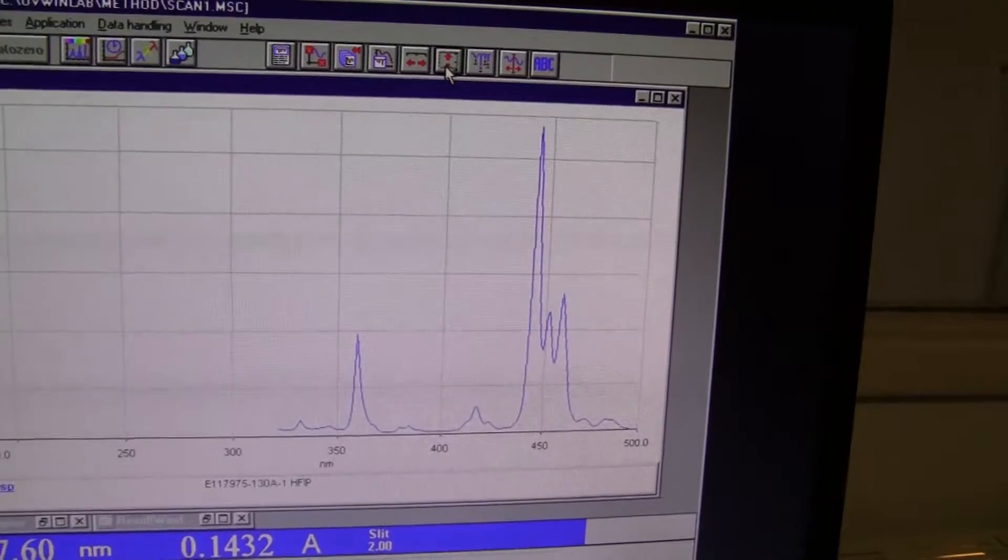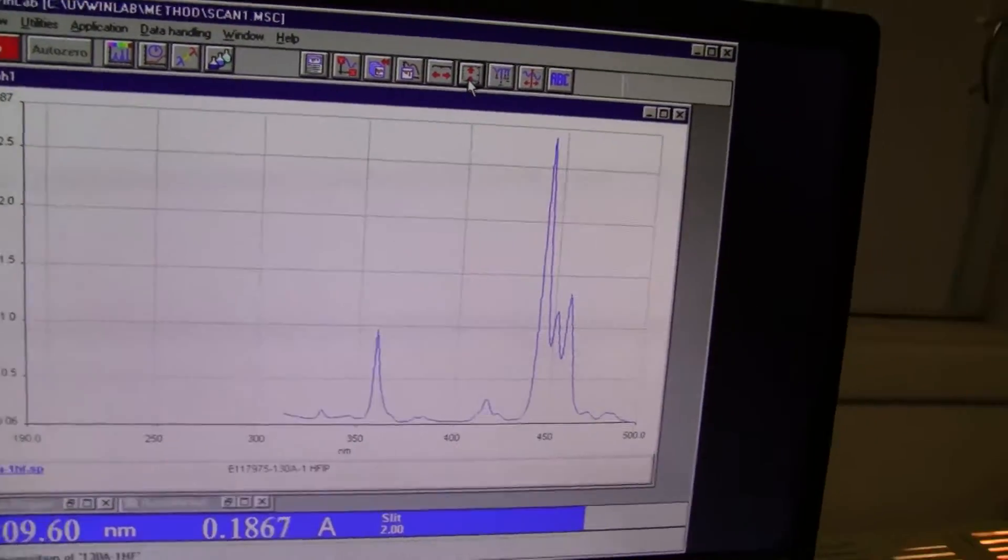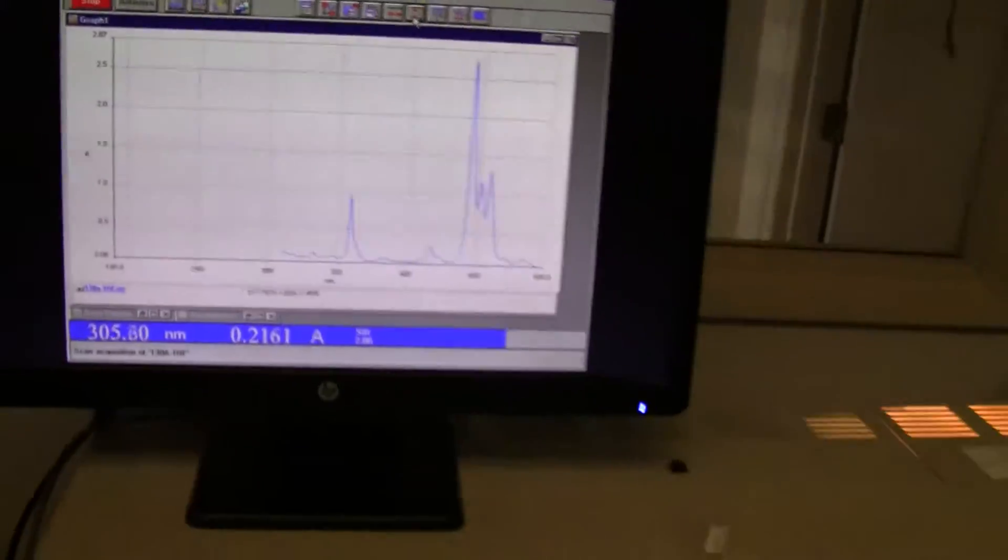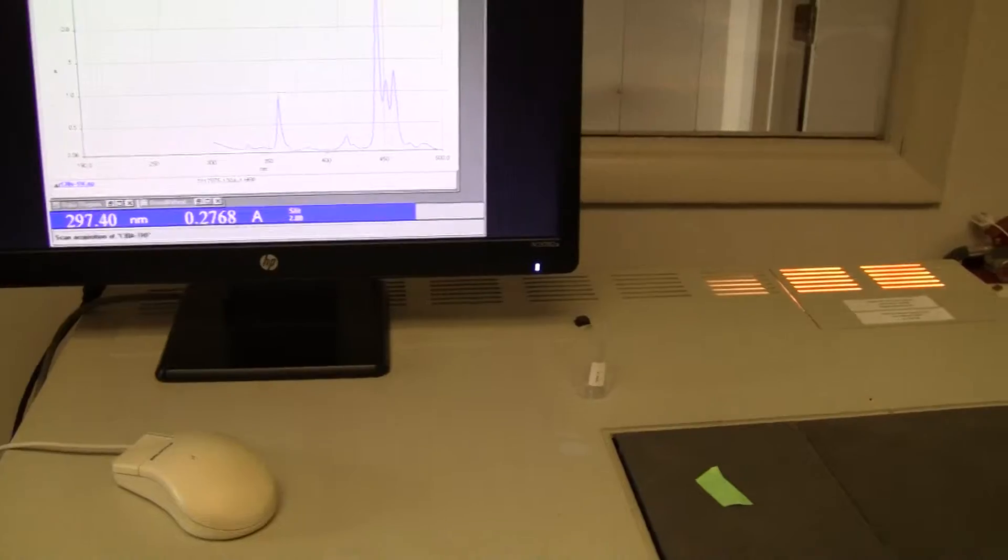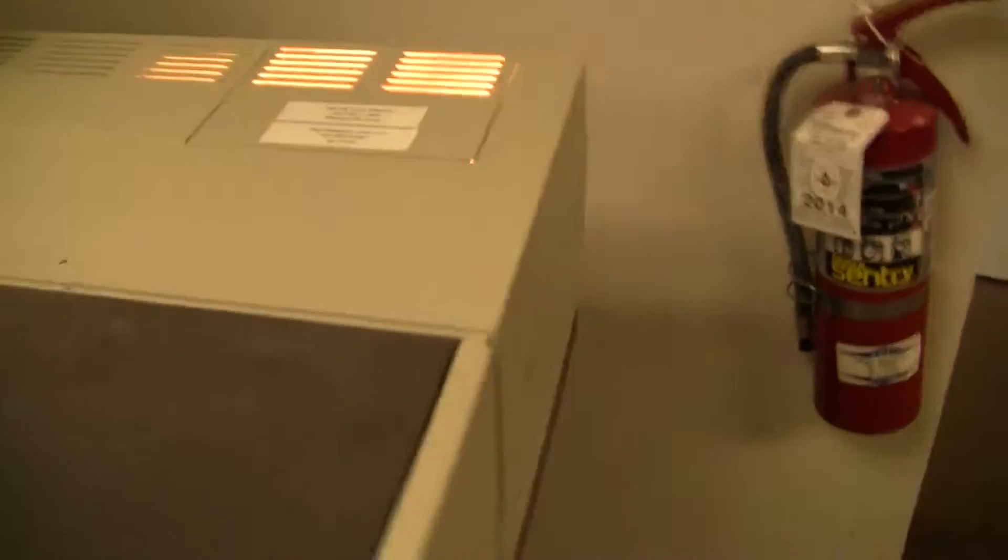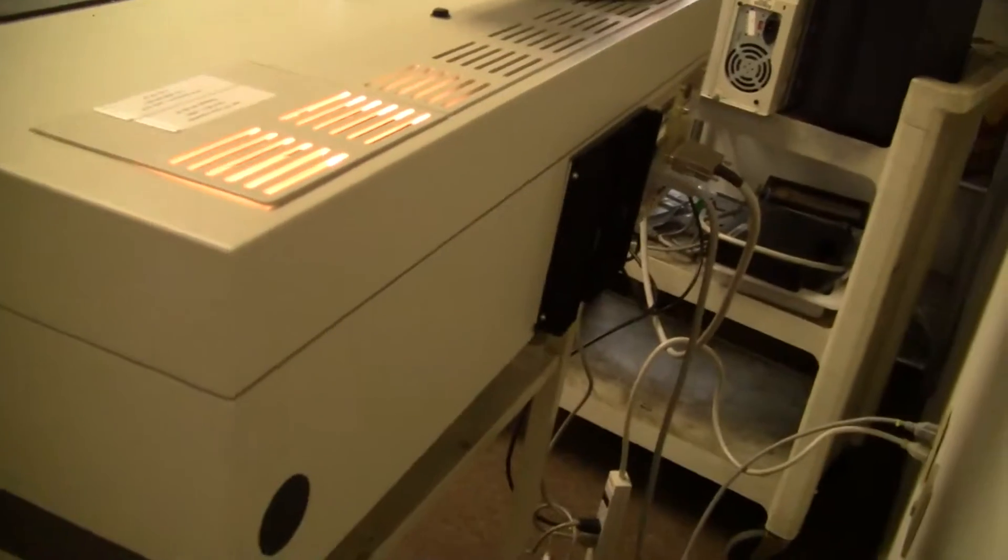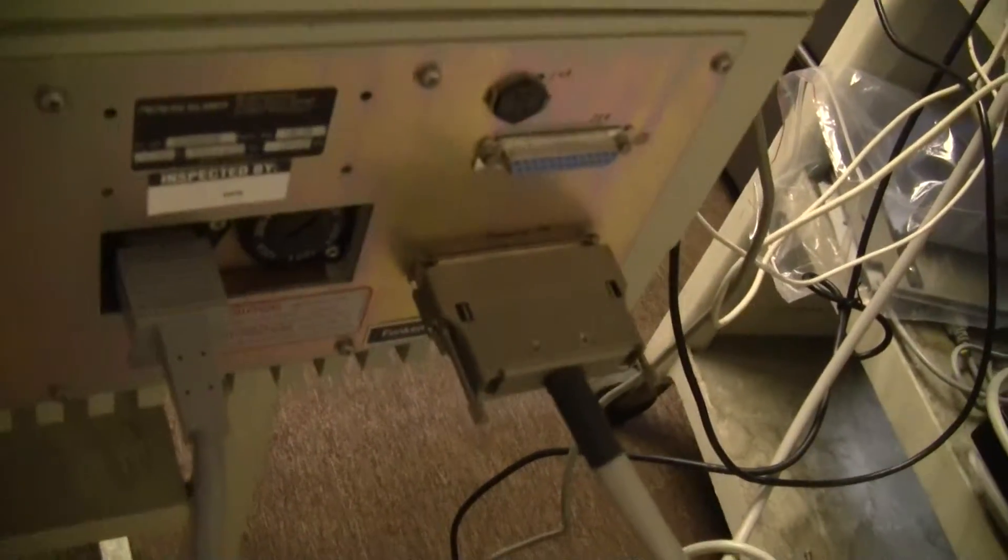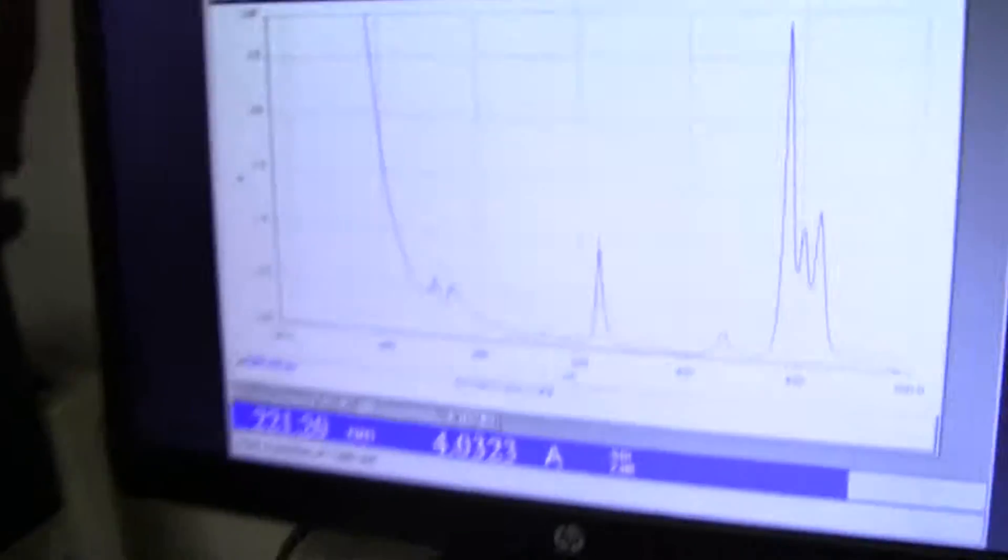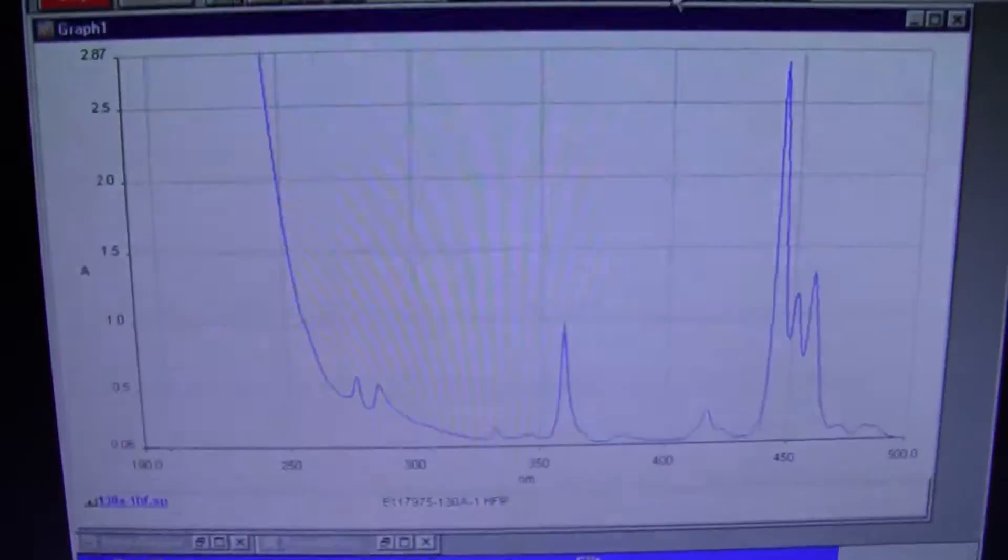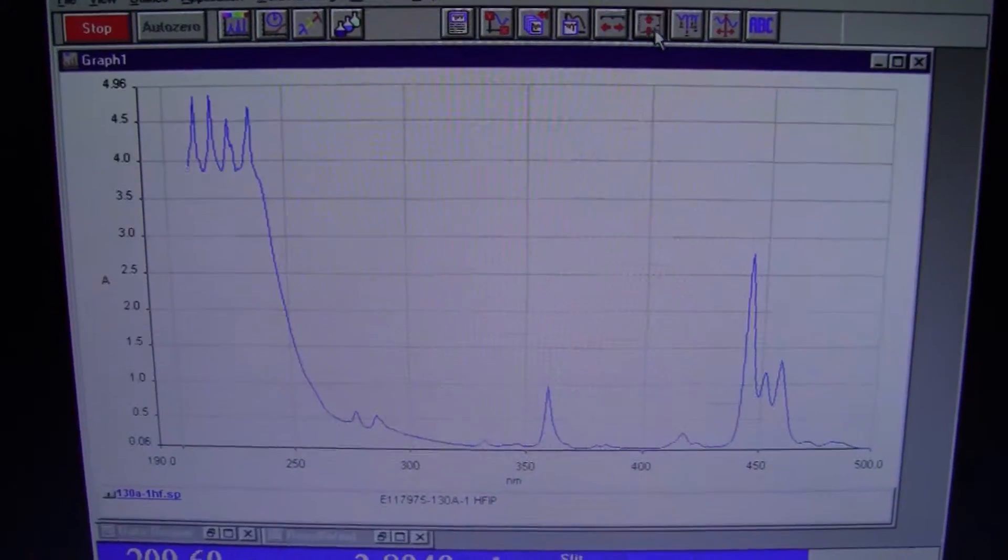And we're now going to go through a little bit of the lamp change, going over to the UV. In the back, see the back of it? It does have the adjustable voltage. There, it's running off scale, as expected.